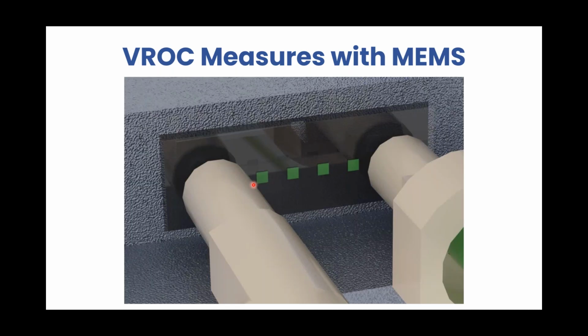the viscosity. So you have this pressure drop along the channel because of this resistance that the fluid is encountering in the channel. This resistance, it's coming from the walls of the channel, and you can think of it as like a friction force, like a friction that's created from the wall of the channel. So this creates this pressure in the channel that also causes the pressure drop.